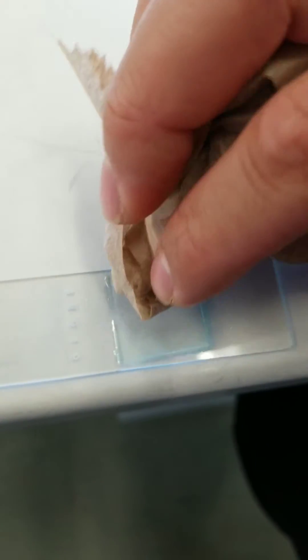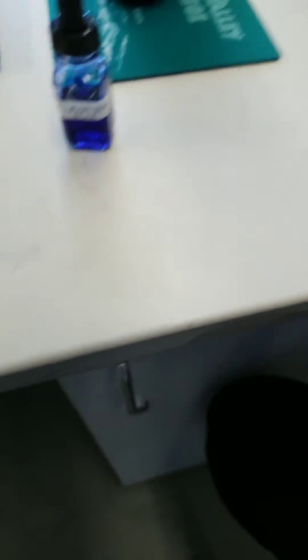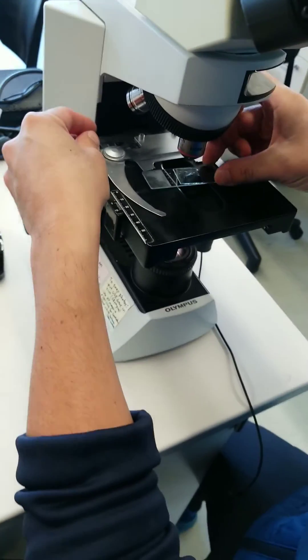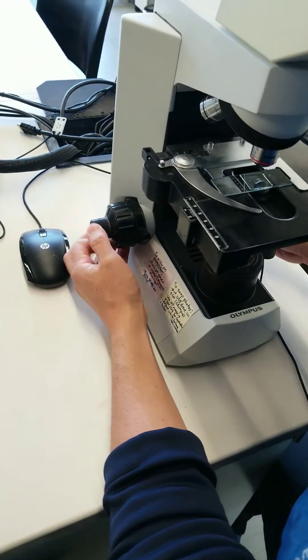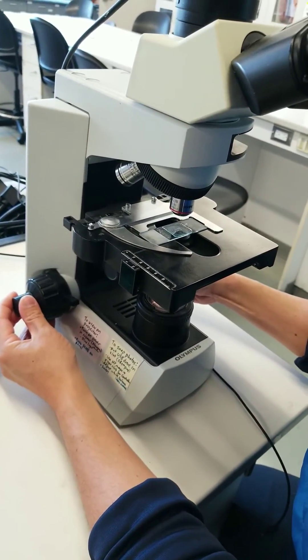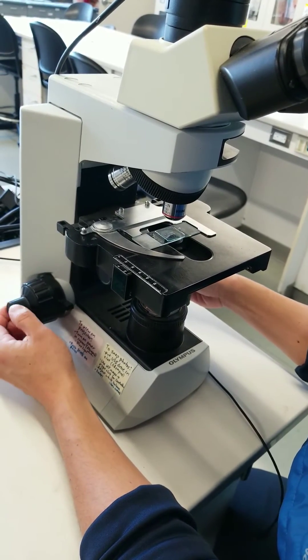With minimal bubbles. If there are bubbles, not the end of the world — you can always try to push them out, but it's just a nicer view when you don't have bubbles. I'm going to place my sample on top, and we're going to look for my skin cells.